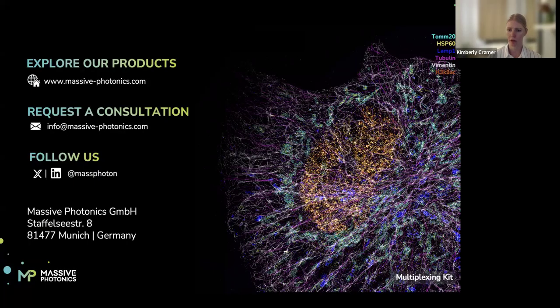So that's a DNA structure. You can also use it for RNA imaging in cells. More of the cutting edge thing that people are trying to look into now is DNA imaging using DNA paint. However, this is not something that has a protocol established so far. So that would be an emerging field.